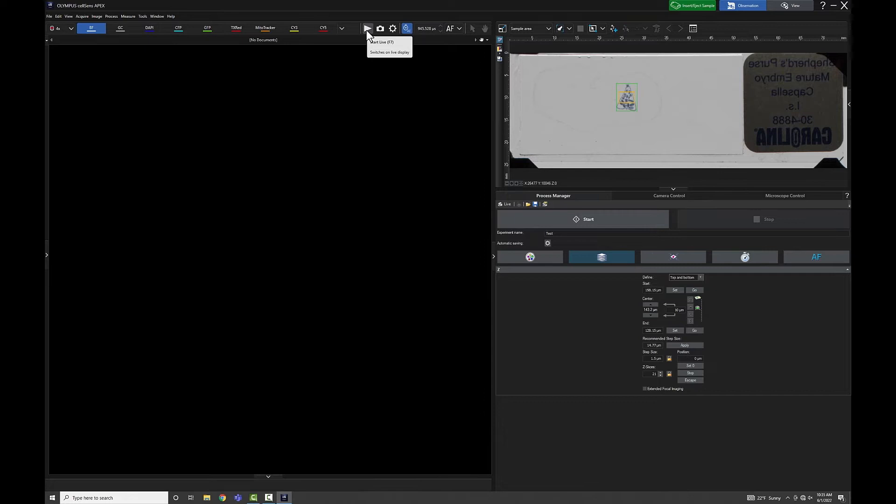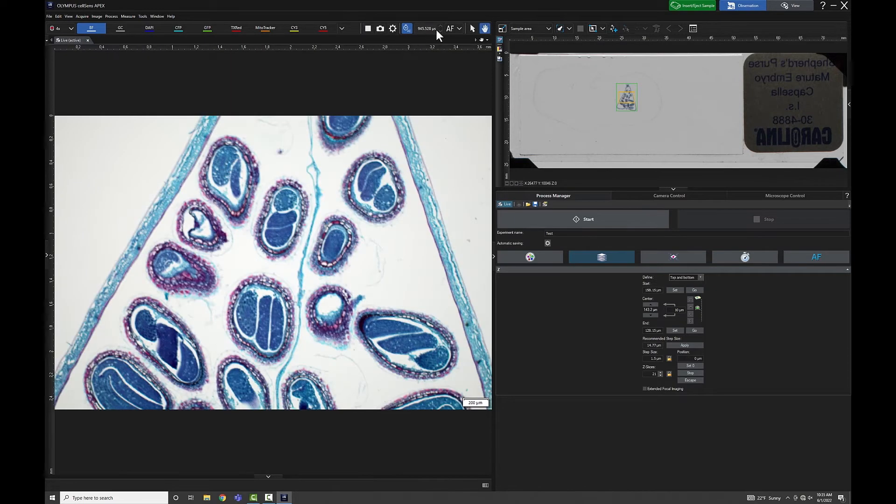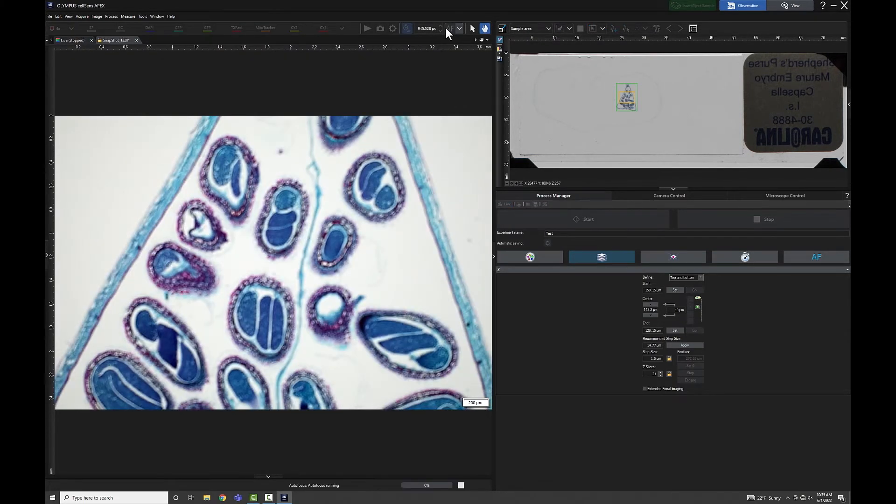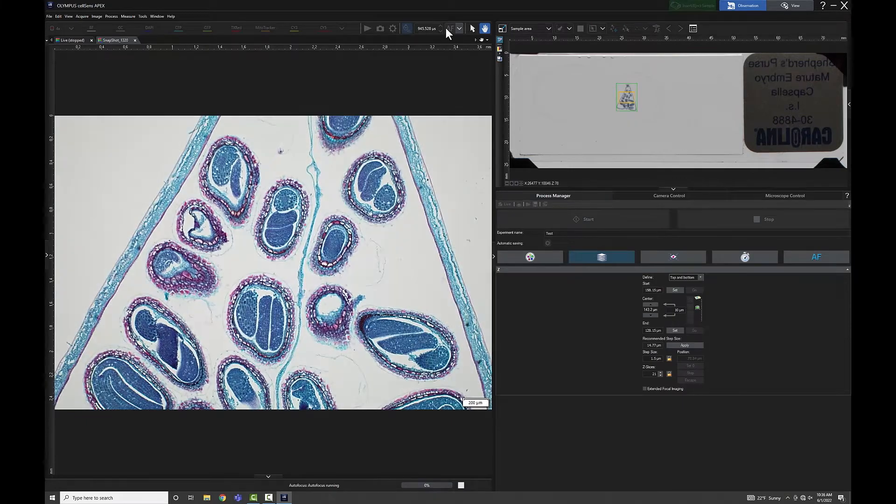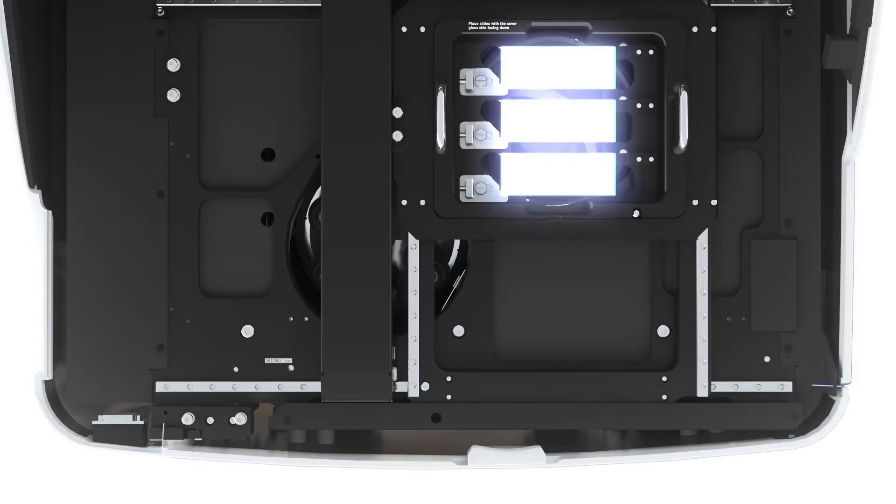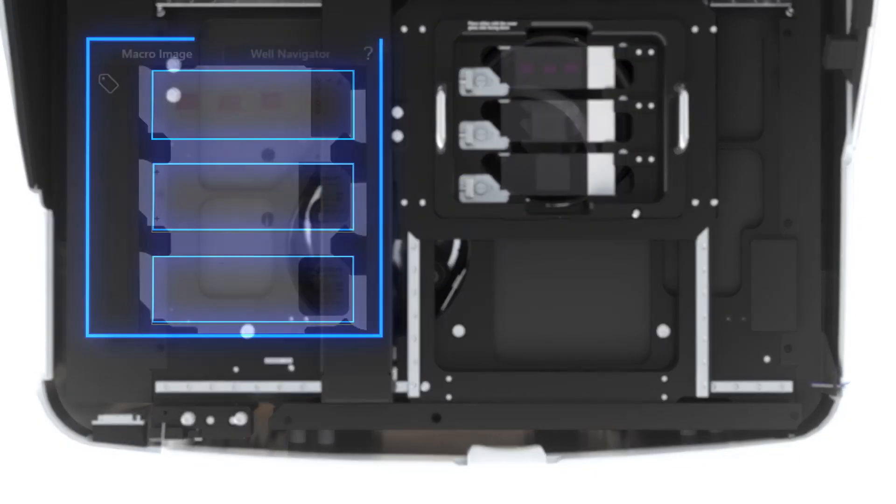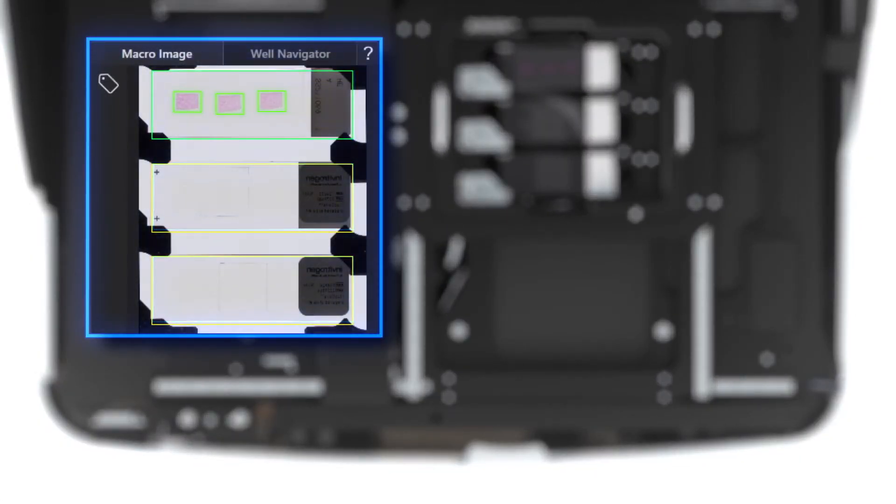The microscope automatically recognizes what type of sample has been added and will immediately capture an overview image of the insert. The built-in AI is trained to recognize and detect biological specimens.